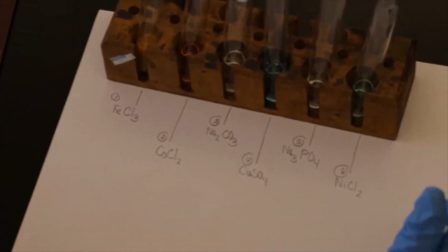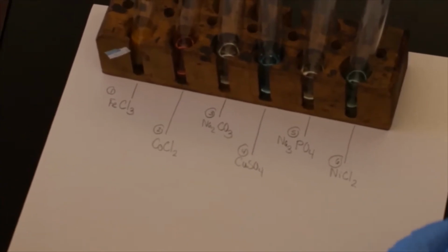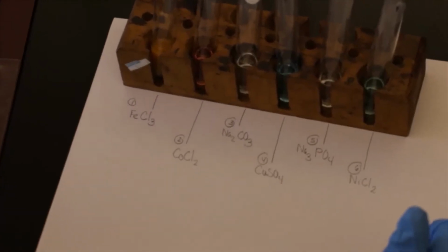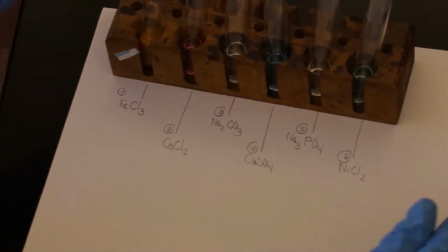This is part E, where we're going to react a bunch of different salt mixtures. So the first thing I want to do is go over what they look like by themselves, and then we're going to react them together and see what forms. So we are using 0.1 molar for our concentration for all of these. So they're all the same molarity.